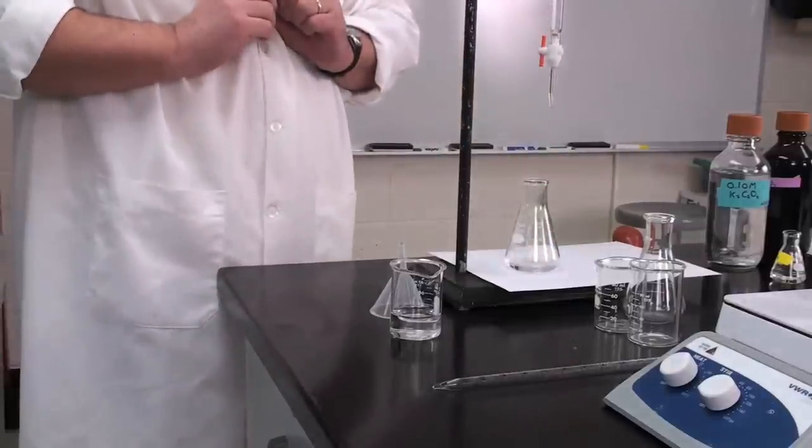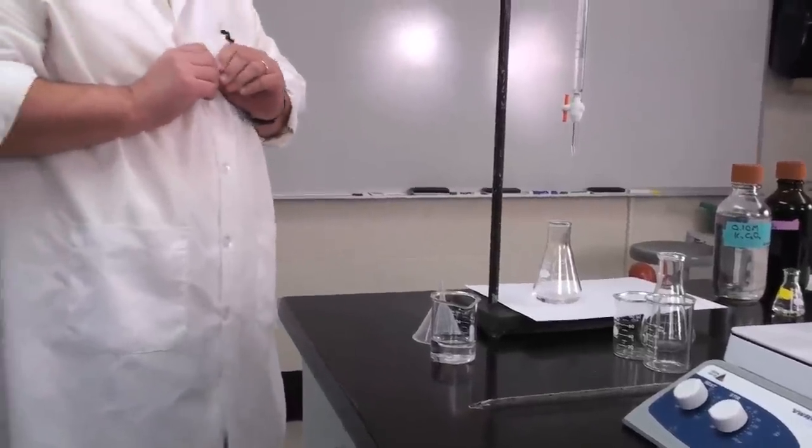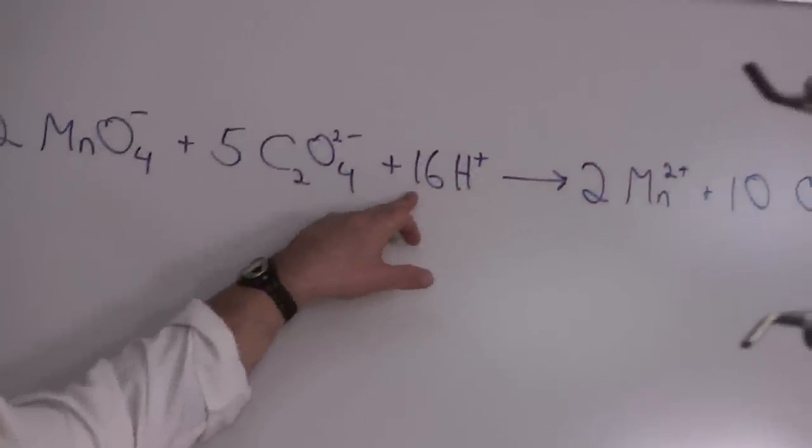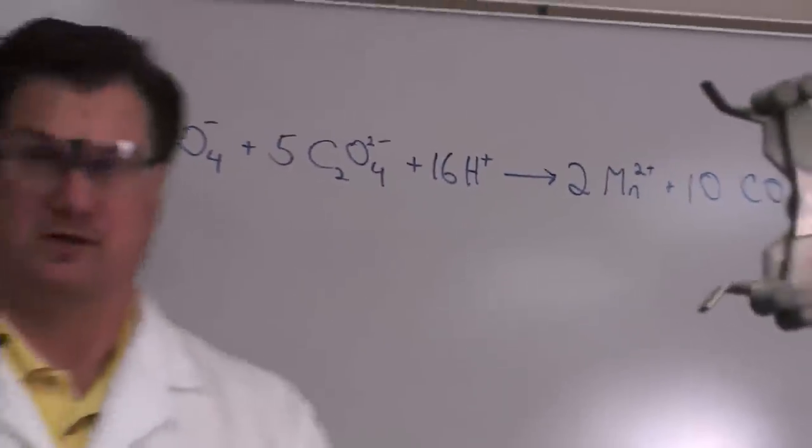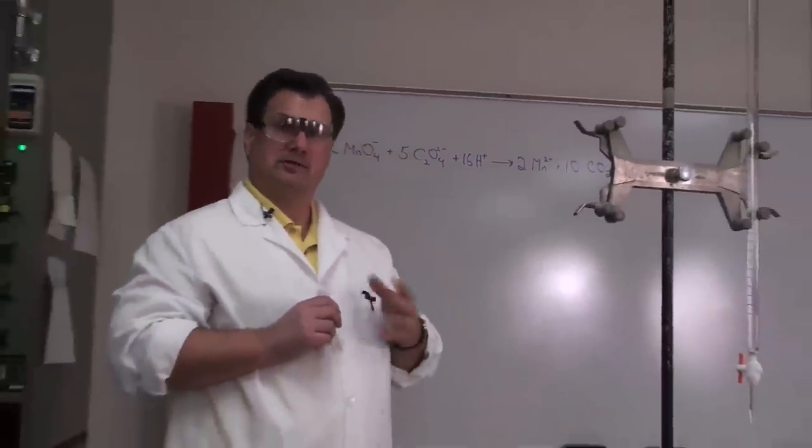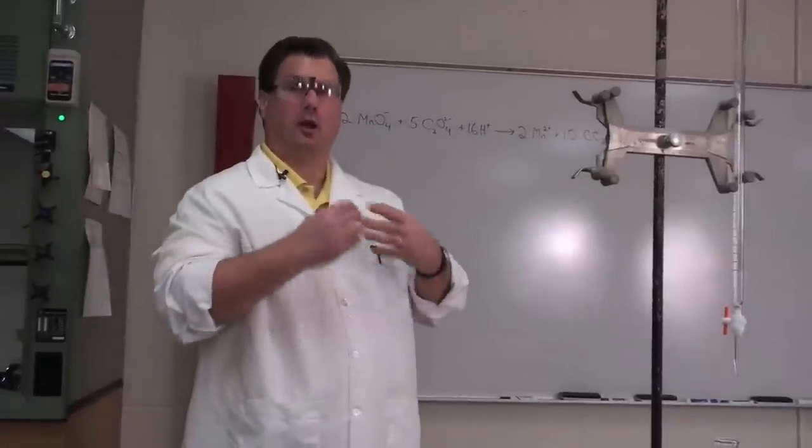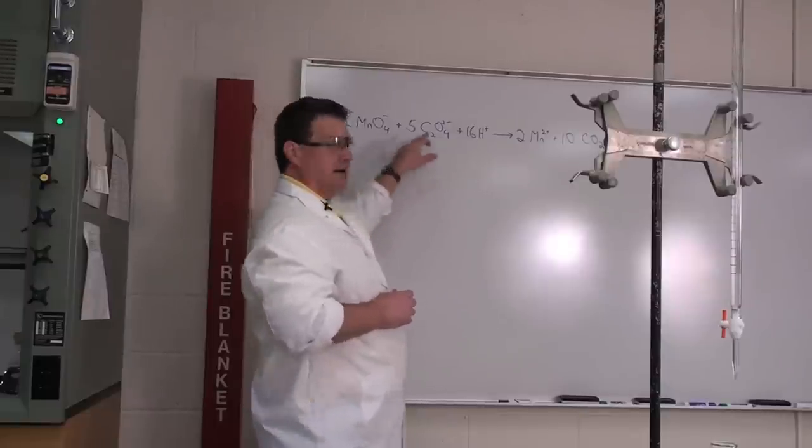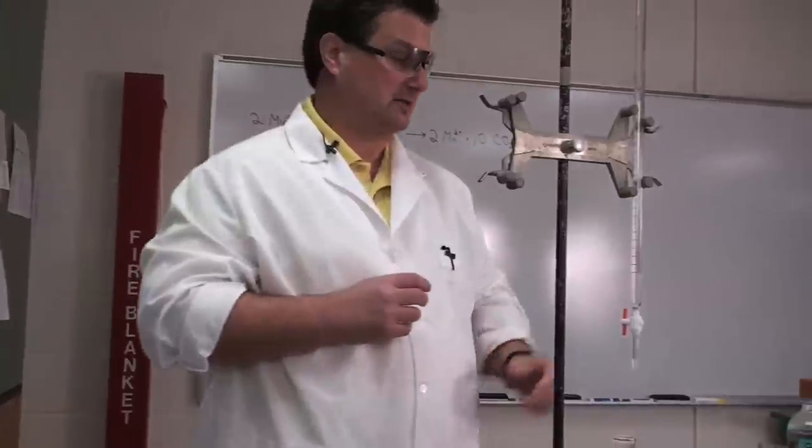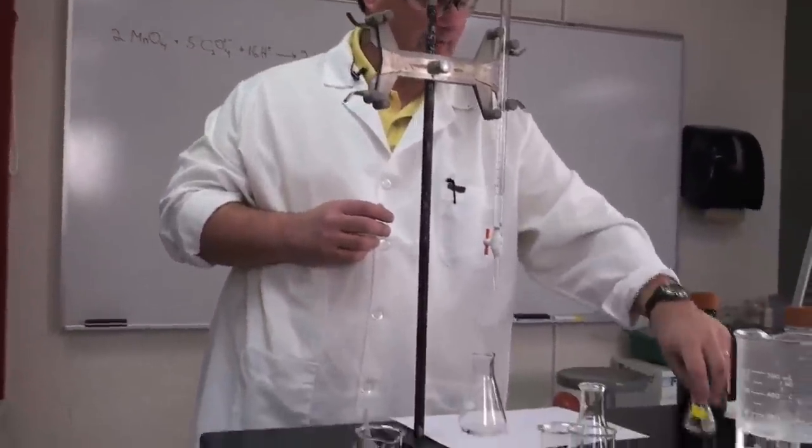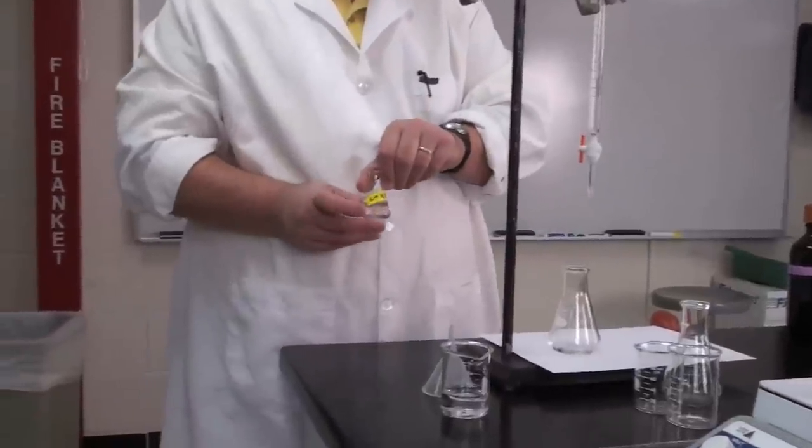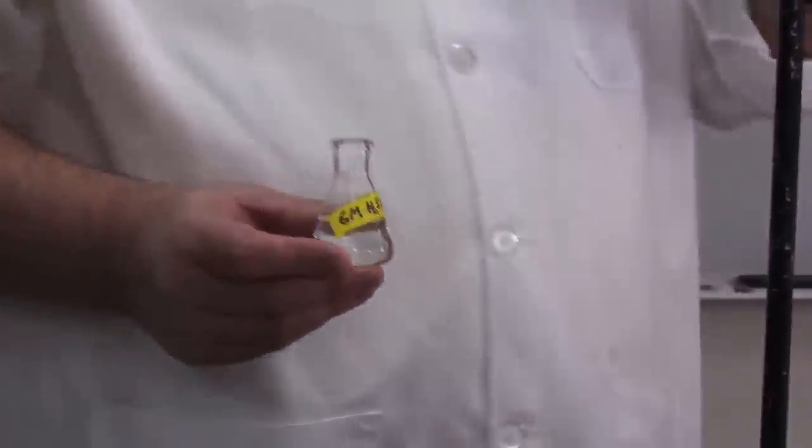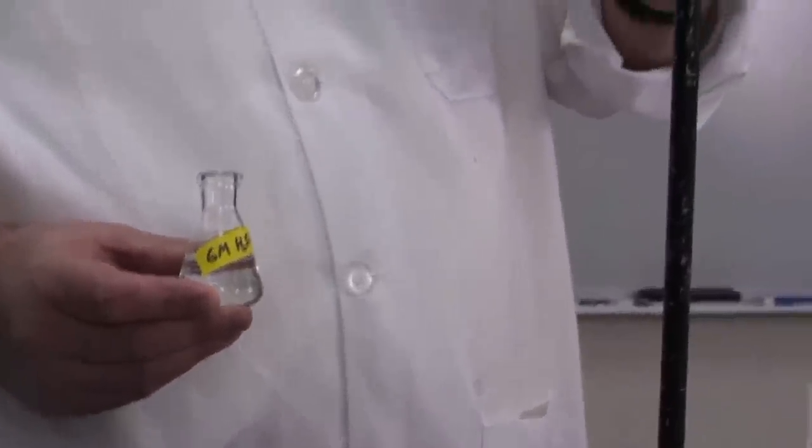Notice that in our balanced chemical reaction, the reaction requires acid—hydrogen ion. So I've got to put some in there. Our goal is not a precise amount—we just want a large excess because it takes 16 hydrogen ions for every 2 permanganates and 5 oxalates. I have made up a 6 molar sulfuric acid solution and I'm going to put about a milliliter into my reaction using this small disposable transfer pipette.